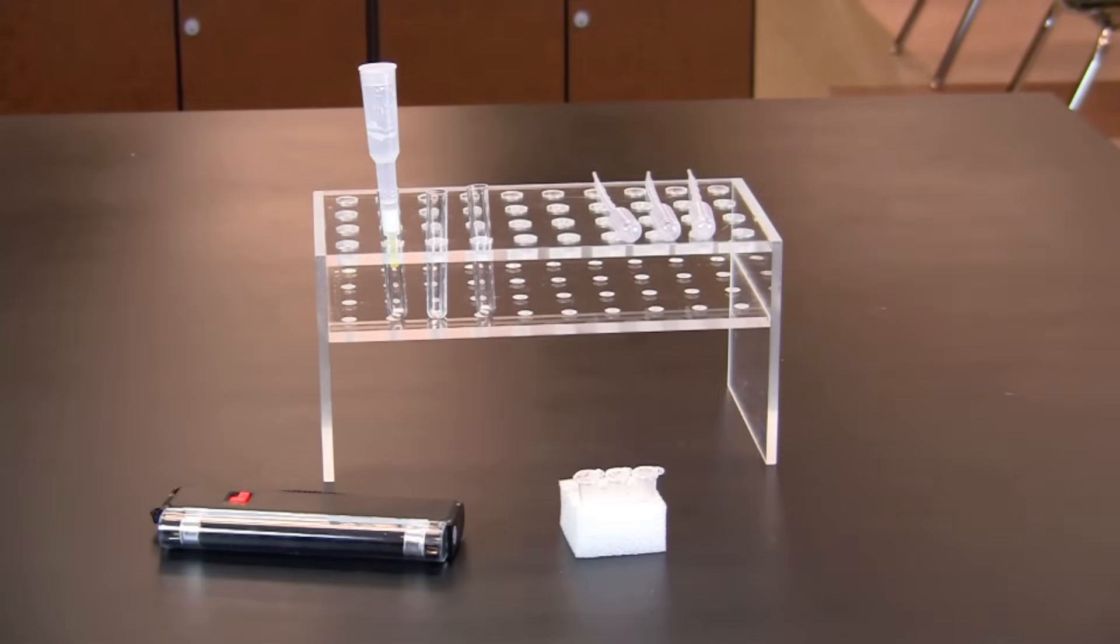In this video you will learn how to perform hydrophobic interaction chromatography or HIC. Chromatography is a powerful technique for separating proteins in a complex mixture. HIC separates molecules based on their hydrophobicity. In this activity, green fluorescent protein or GFP will be separated from the thousands of endogenous proteins present in the E. coli used to produce the recombinant protein.